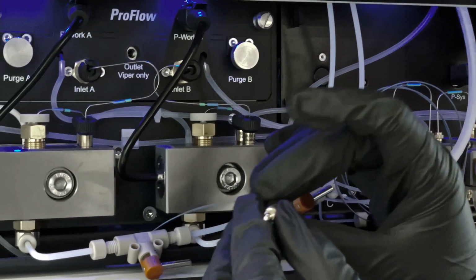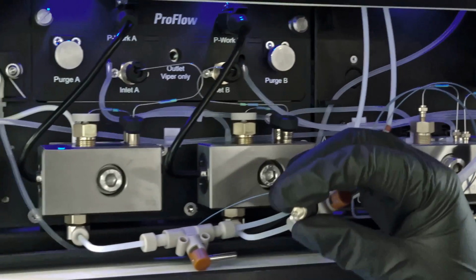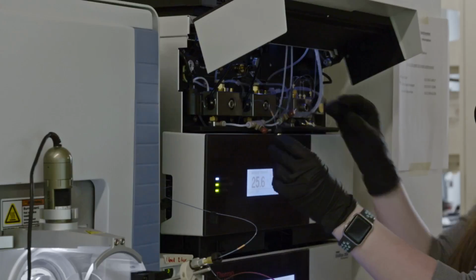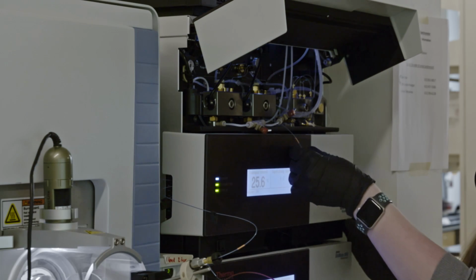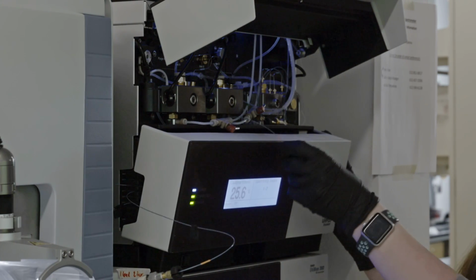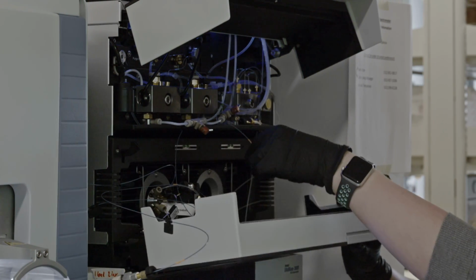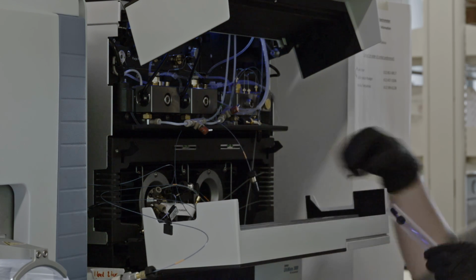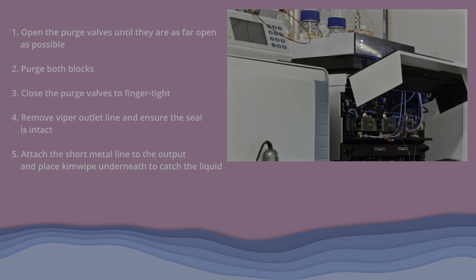Otherwise, if the seal is in place, go ahead and put a cap on the line and let it hang down. For this part, we will also open the column oven door. And then we will install this metal line.